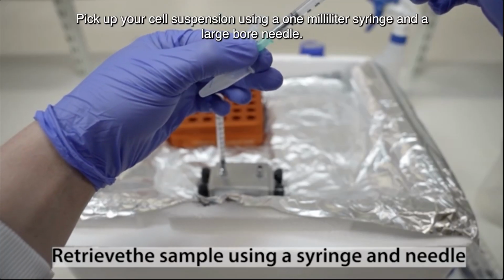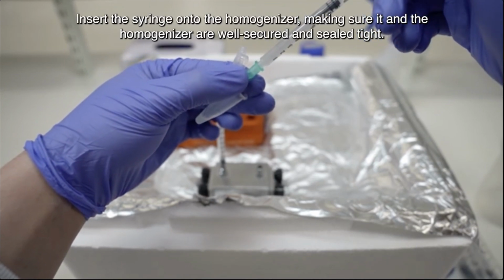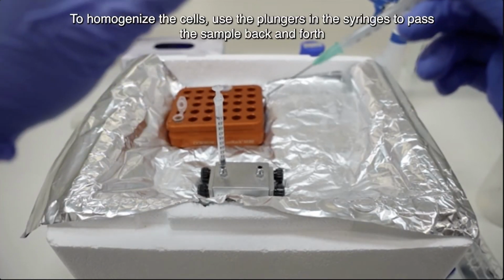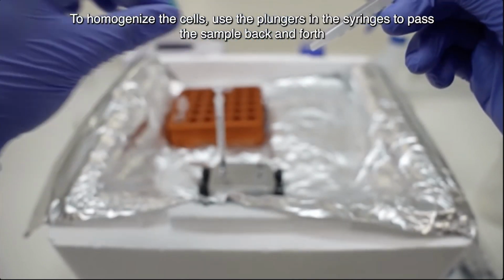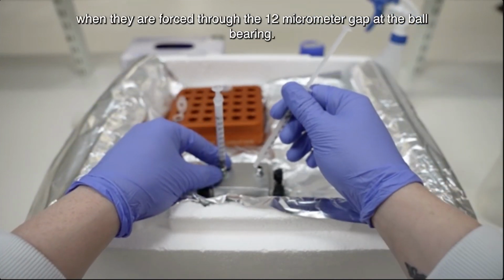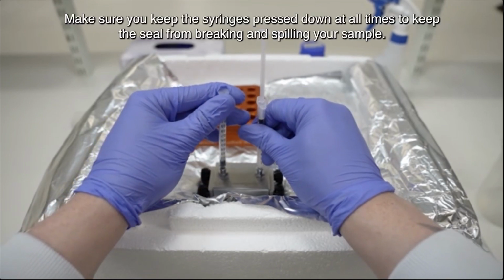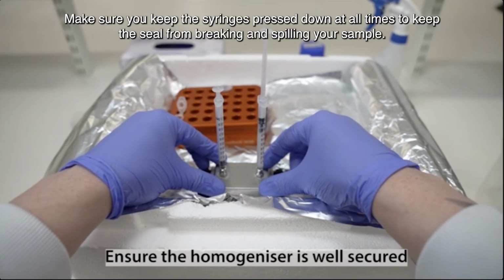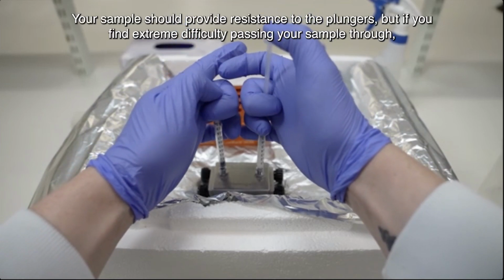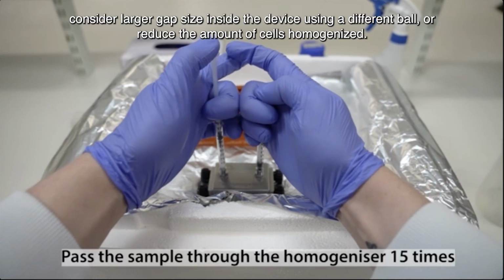Take up your cell suspension using a 1 milliliter syringe and a large bore needle. Insert the syringe onto the homogenizer, making sure it and the homogenizer are well secured and sealed tight. To homogenize the cells, use the plungers in the syringes to pass the sample back and forth through the chamber 15 times. The cells will break by physical shearing force when they are forced through the 12 micrometer gap at the ball bearing. Make sure you keep the syringes pressed down at all times to keep the seal from breaking and spilling your sample. Your sample should provide resistance to the plungers, but if you find extreme difficulty passing your sample through, consider a larger gap size inside the device using a different ball or reduce the amount of cells homogenized.